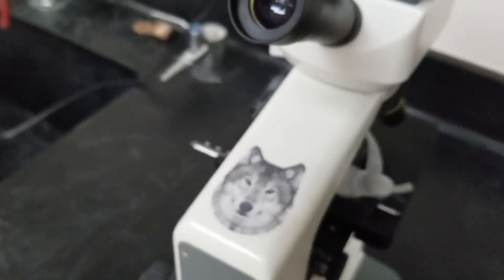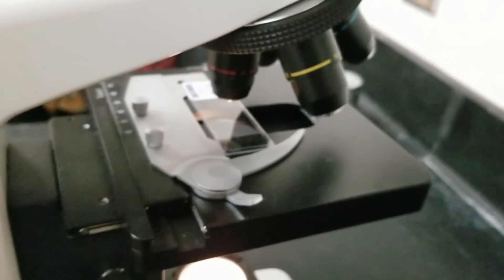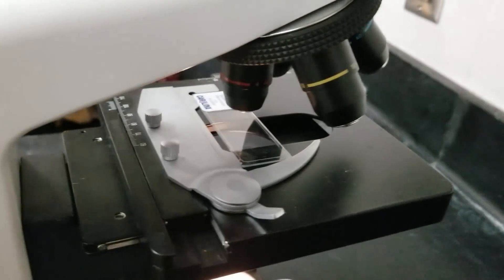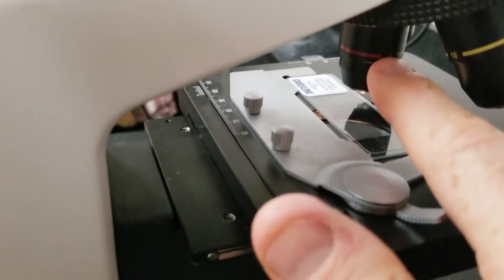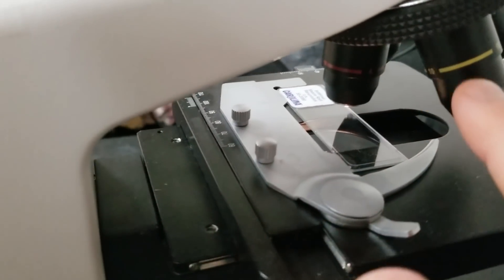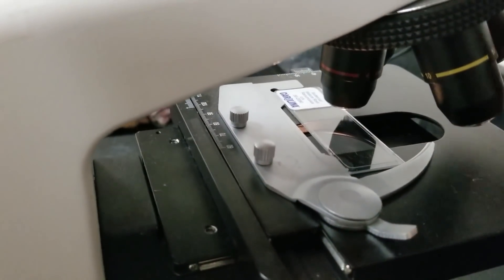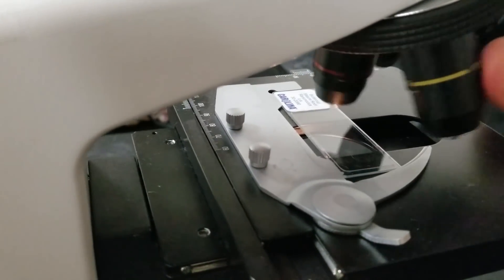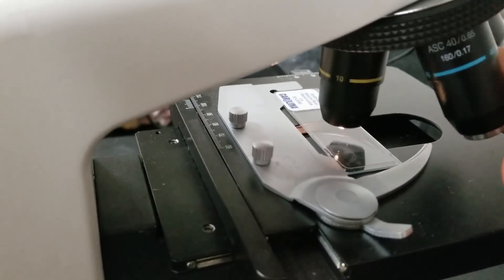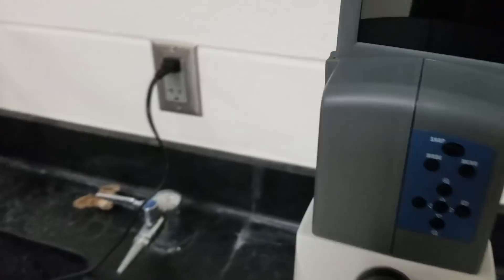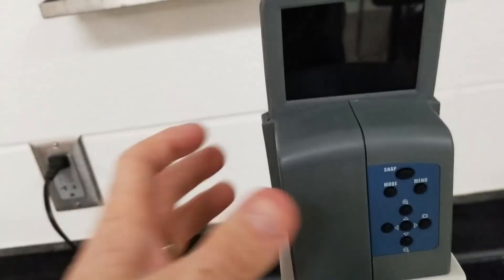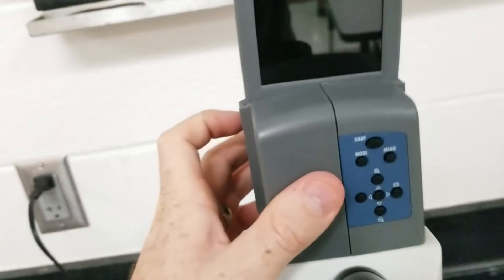If we're moving to a higher objective, for example, I'm going to go to the next one. That had 4X on that. That's 10X on this. I'm going to move and it will kind of click into place.